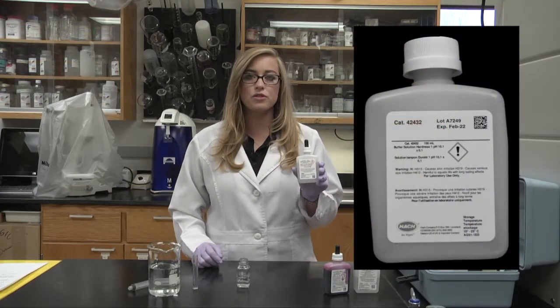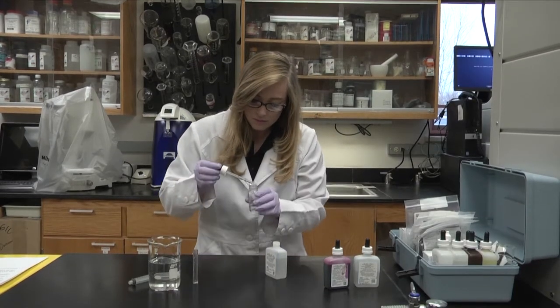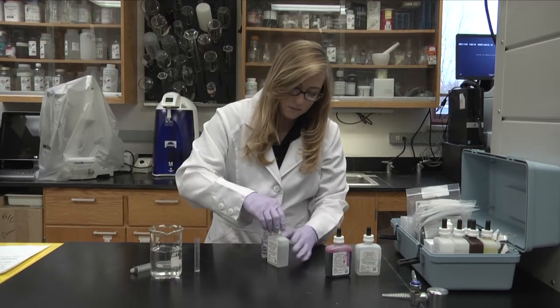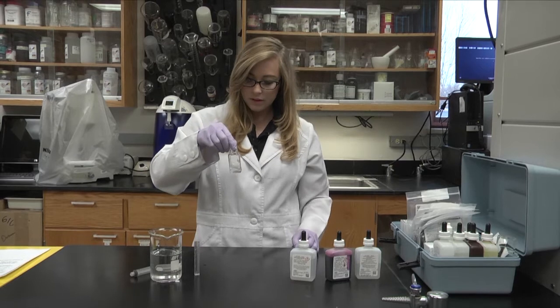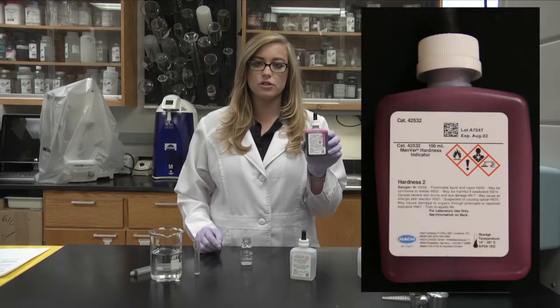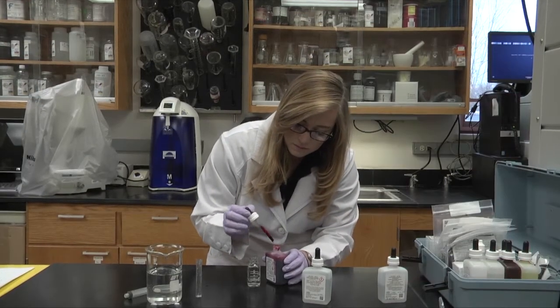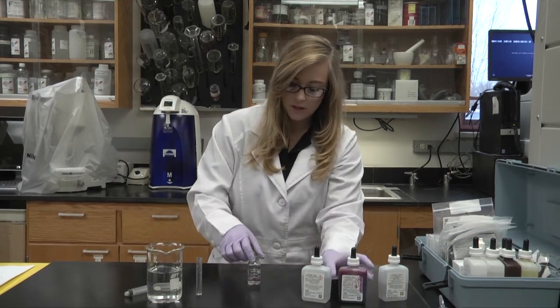Now we're going to add three drops of the buffer solution, hardness one. Swirl to mix. We will now add one drop of the Mander hardness solution two, and then swirl to mix.